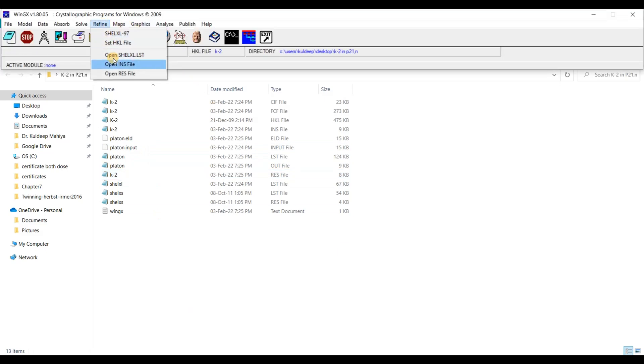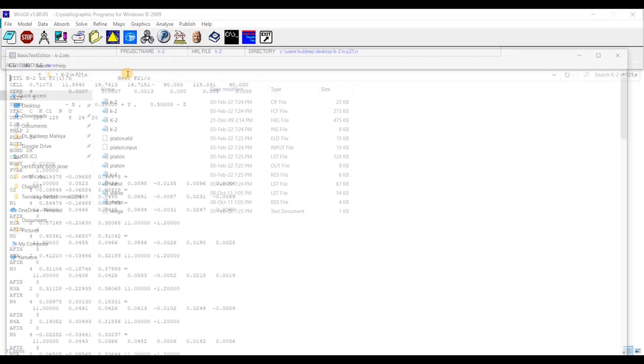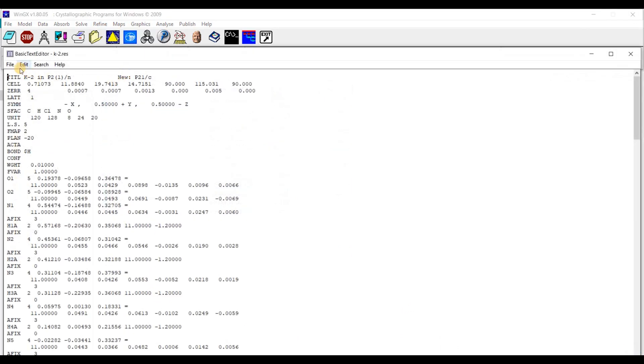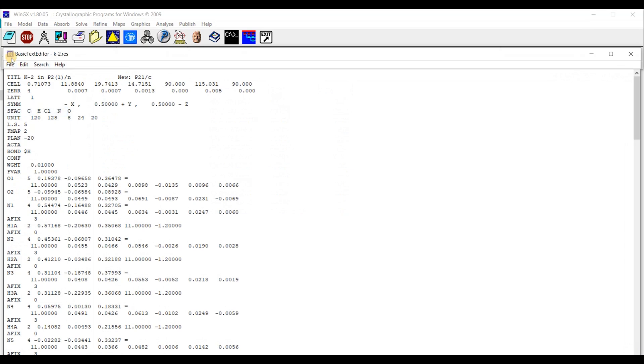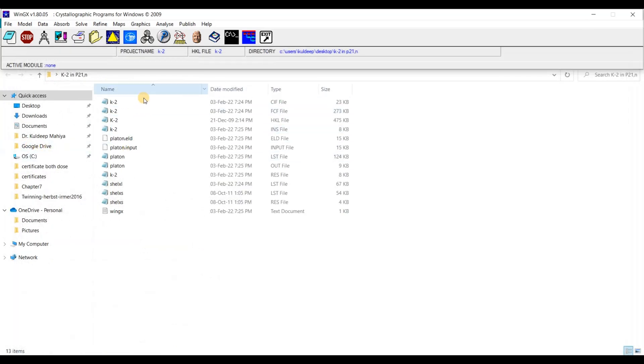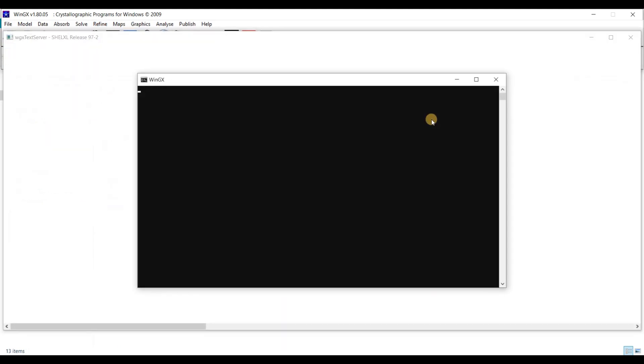Refine, Open res file, File, Save as INS and exit. Now refine with SHELXL-97.